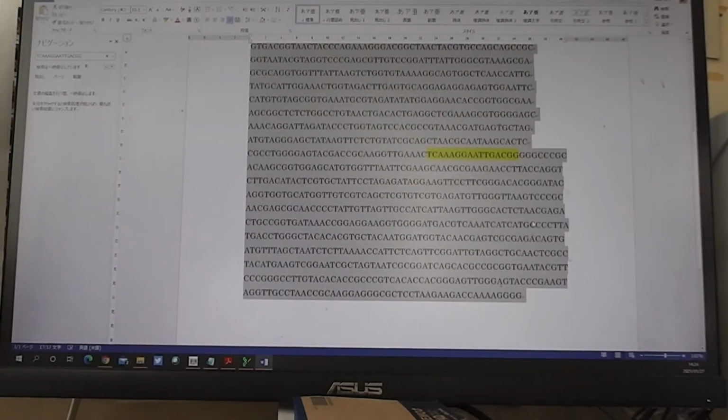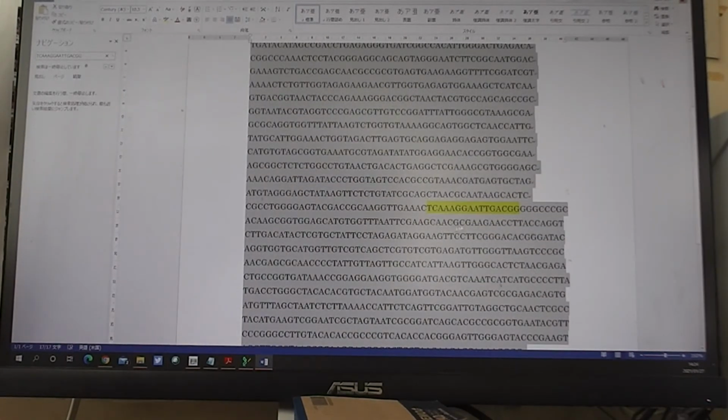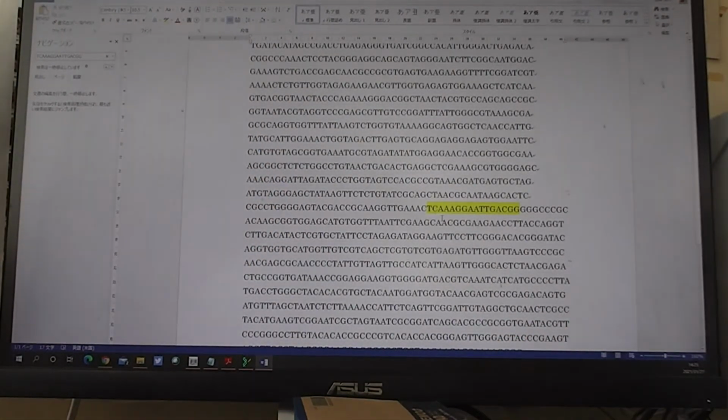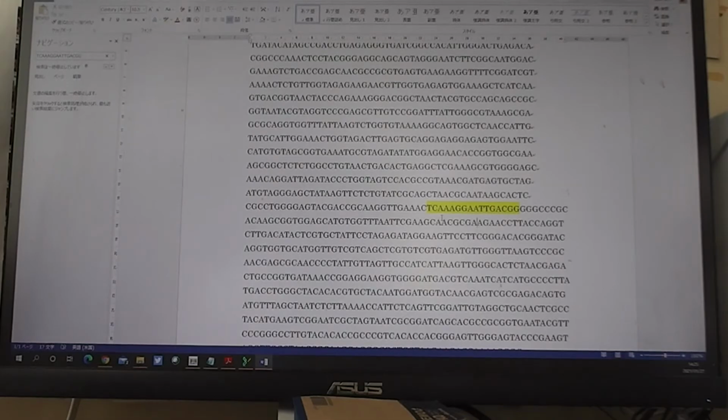Yes. So if you want to know longer sequence data, this one is just 1,600 base pairs, but for example 3,000 or 5,000, we need to use various primers, not 2 but 4, 5, 6 primers, and we need to combine them together. But if we increase the number of primers, no problem, it is just the same way. By using Word, we can look for the overlapped areas like this and combine them together, and so we can get the full length of each gene.